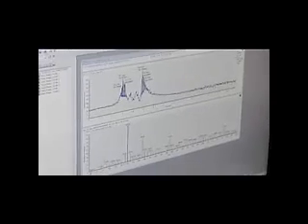I don't know why that one got me. That's weird. I wanted to save this. You could. So you click on your name and then it pops up. The printing on this one doesn't print to PDF, so the best thing you can do is take a print screen, a snapshot of it, and then edit it in Paint, which is also on this computer, and save it as an image, like a JPEG. That's the only way I know how to save these graphs off of this computer.